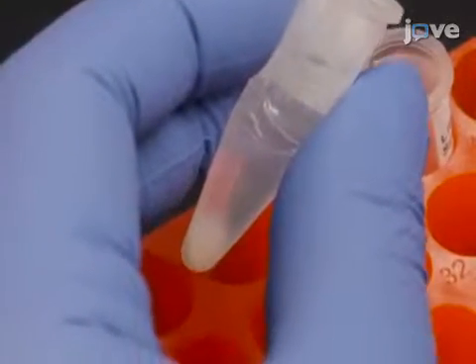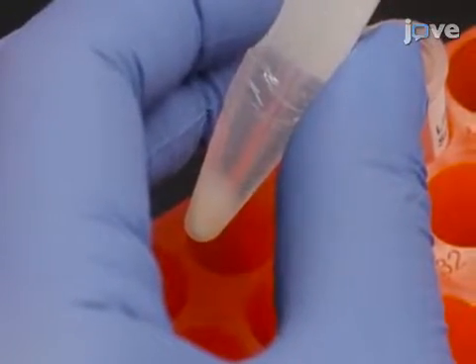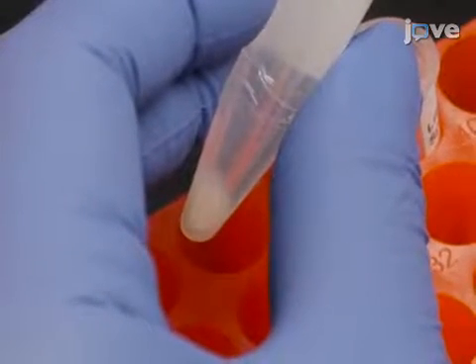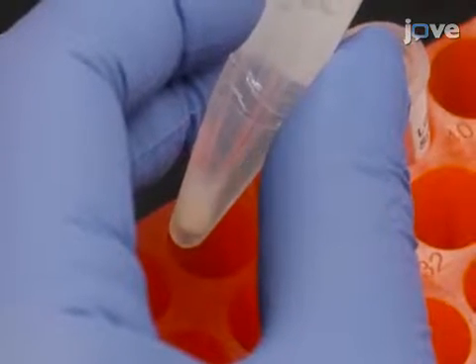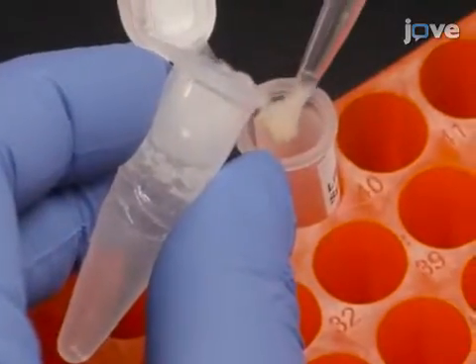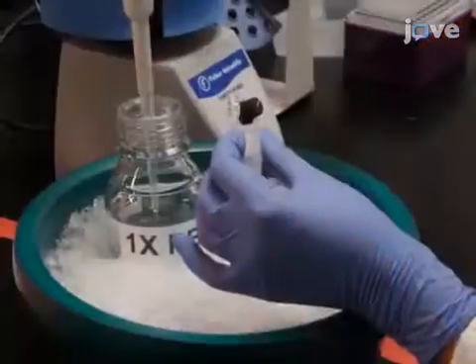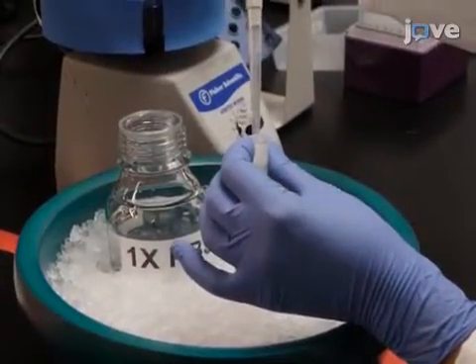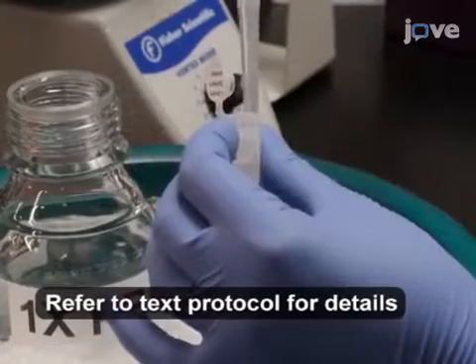With a micro pipette and a 1 milliliter tip, slowly pull up a portion of the pellet. Then, while holding the tube at an angle with the opening directly above a new 1.5 milliliter tube, slowly lift the pipette tip out of the supernatant and slide the pellet into the new tube. After removing excess supernatant, use 1 milliliter of ice-cold PBS to re-suspend the spheroplasts.